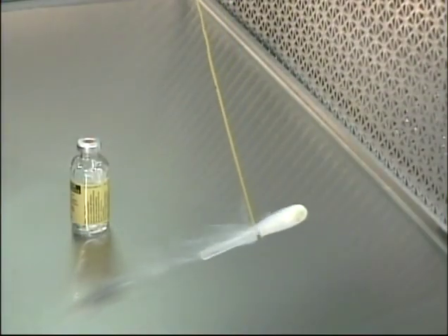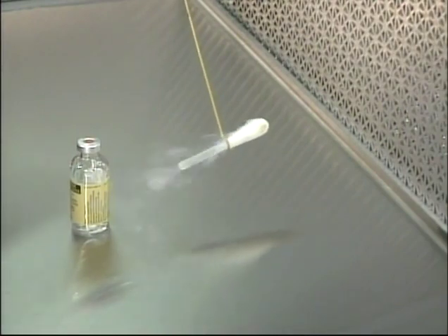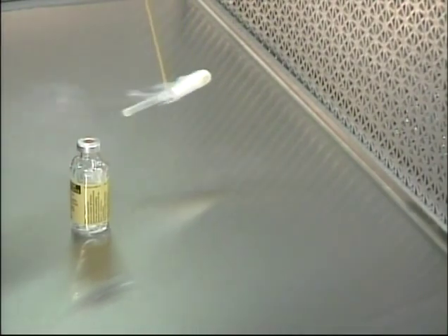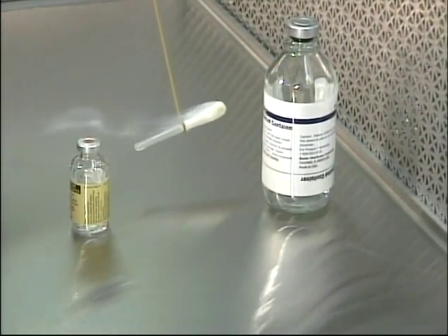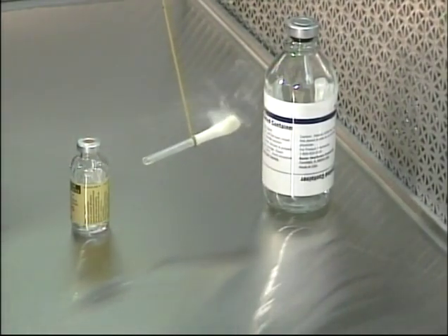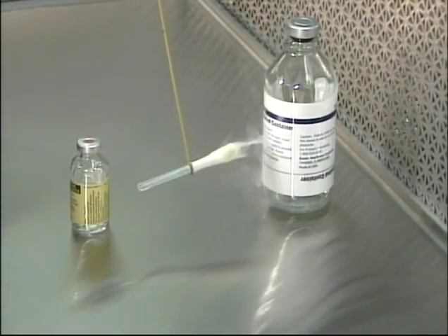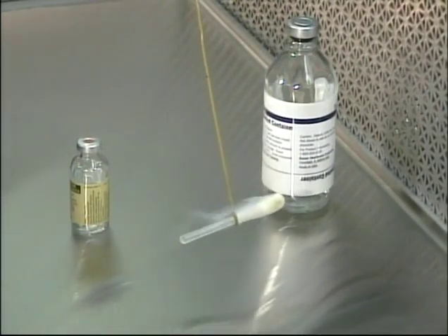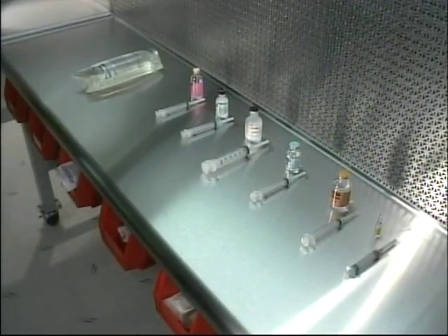As long as the critical site remains within the undisturbed first air, the operator can be assured that no airborne contaminants have been introduced. If the airflow from the HEPA filter makes contact with any object before coming into contact with a critical site or pathway, it is no longer possible to be certain that only clean air is reaching the critical site. Make certain that no obstruction blocks the flow of first air to any of these critical sites.